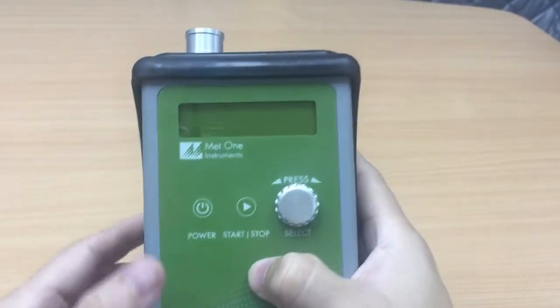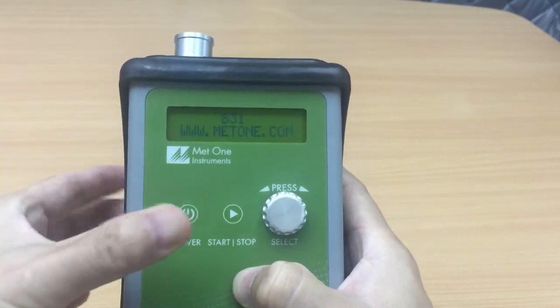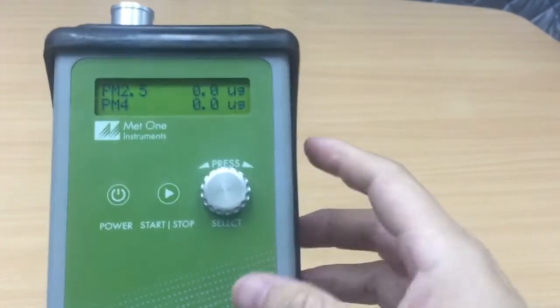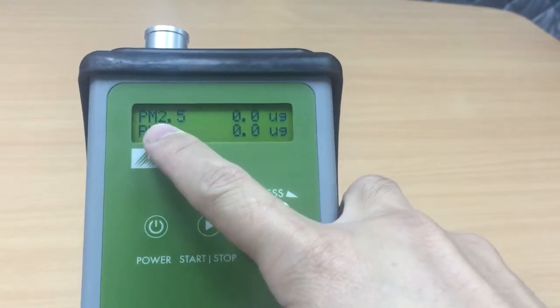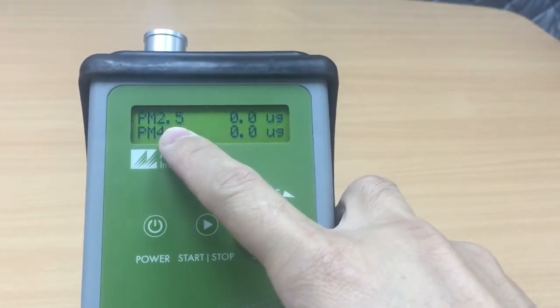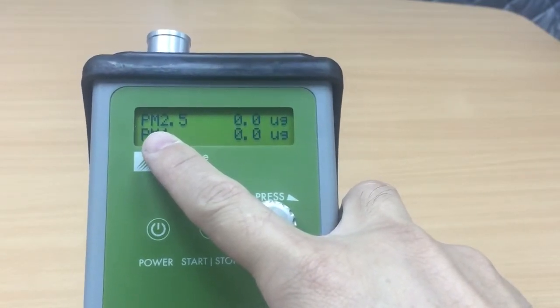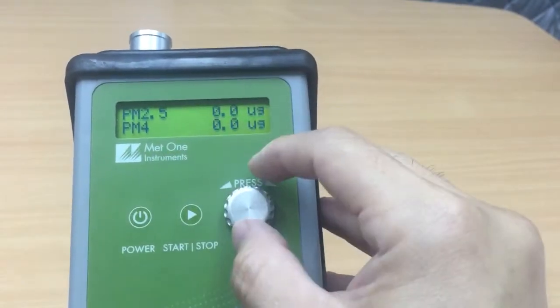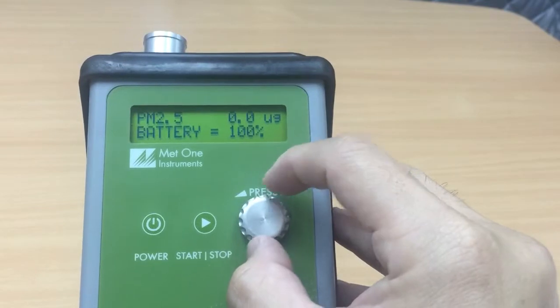Now to turn it on, press the on button over here so press and let go and then we have a Mac 1831 start up. What we see here on the screen, the first screen is a favorite view. That means I can set up the favorite view. In this case here I've set it up to see PM 2.5. The one at the bottom the second row is showing PM4 and I can change the display by turning the knob.